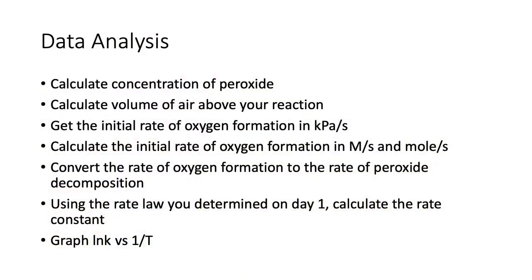If we talk about the data analysis for this reaction, it's kind of similar to the other one. So you'll calculate the concentration of peroxide, you'll calculate the volume of air above your reaction, you'll have the initial rate of oxygen formation in kilopascals per second, then you can get the initial rate of oxygen formation in molarity per second and moles per second. Then you can change your rate of oxygen formation to the rate of peroxide decomposition, same math. And then using the rate law that you determined on day 1, you're going to calculate the rate constant.